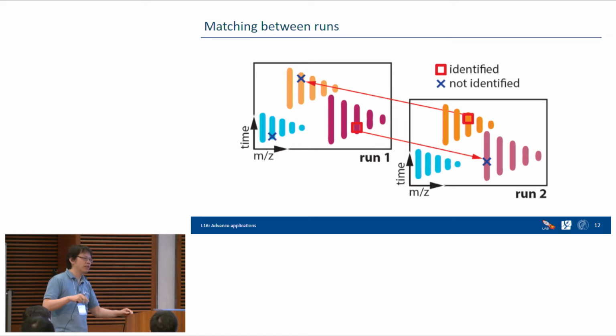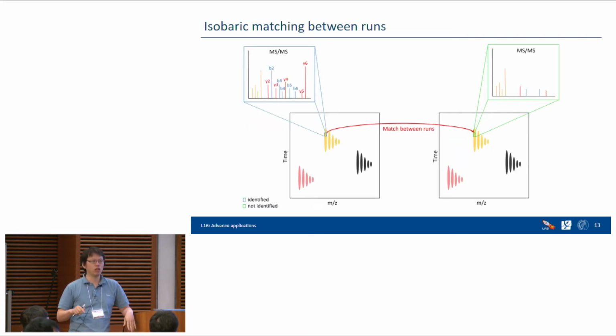Of course, they used a slightly different data acquisition method, but we can still consider these more or less technical replicates. So basically, they have 8 samples, 2 sets of technical replicates, and each technical replicate has 4 biological replicates. This one has no reference channel. All of them are samples.